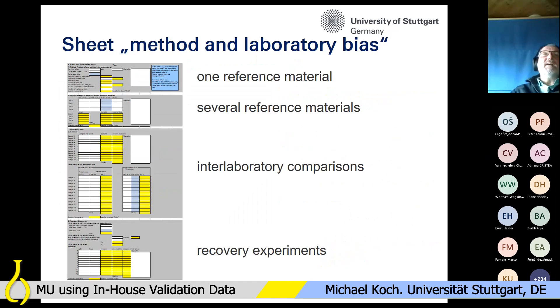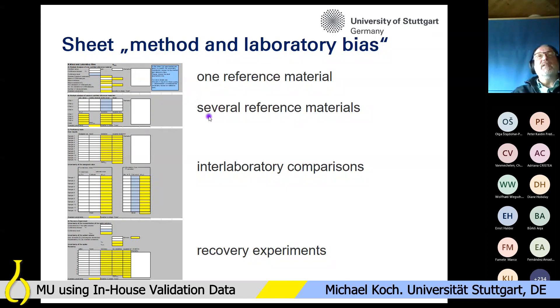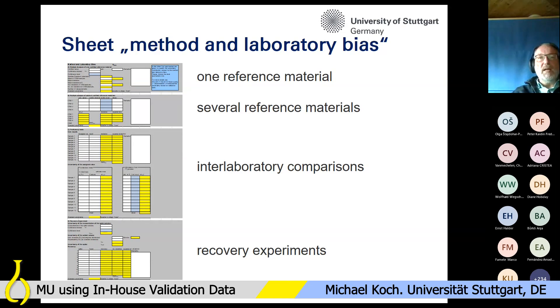In the sheet 'Method and Laboratory Bias' we have four different possibilities. The first is if you use one reference material. The second is if you have several reference materials. The third block is for interlaboratory comparisons or proficiency tests. The last one is if you want to use results from recovery experiments to estimate your bias.